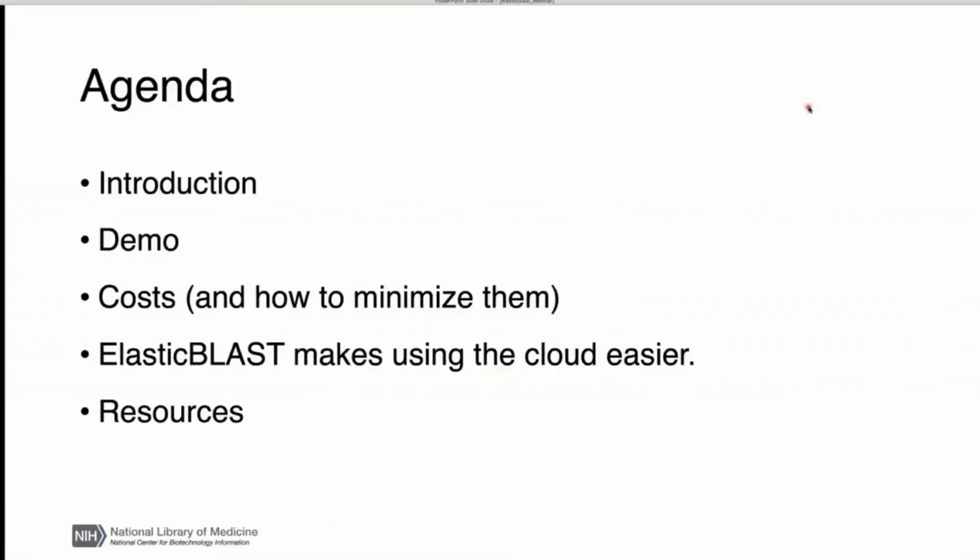First, let's go over the agenda. To start, I'll give you a bit of an introduction and set some context. Then I'll do a demo of ElasticBLAST. That's right, a live demo. Next, I'll show you the range of searches ElasticBLAST can do, how quickly it can do those, and what those cost. Also, we'll talk about minimizing costs and how you can try ElasticBLAST out for free. Then I'll talk about what ElasticBLAST does for you to make using the cloud easier. Finally, we'll discuss resources that can help you.